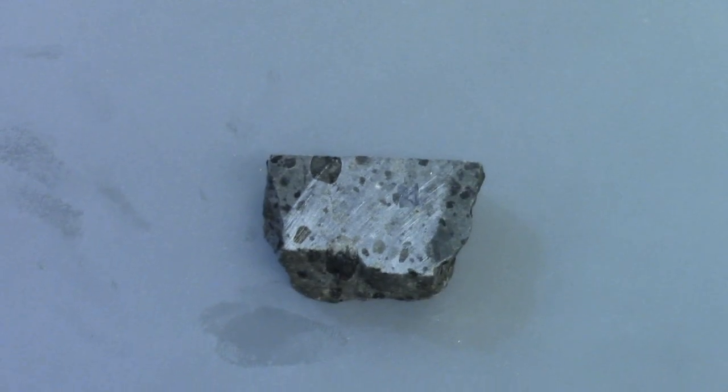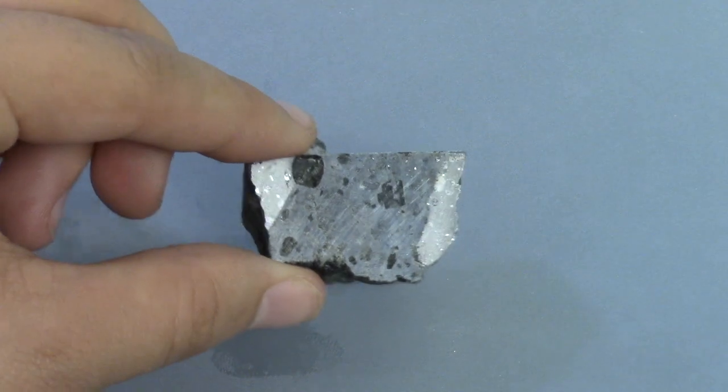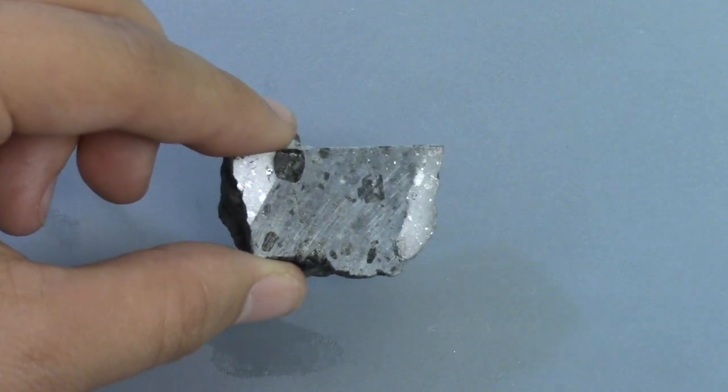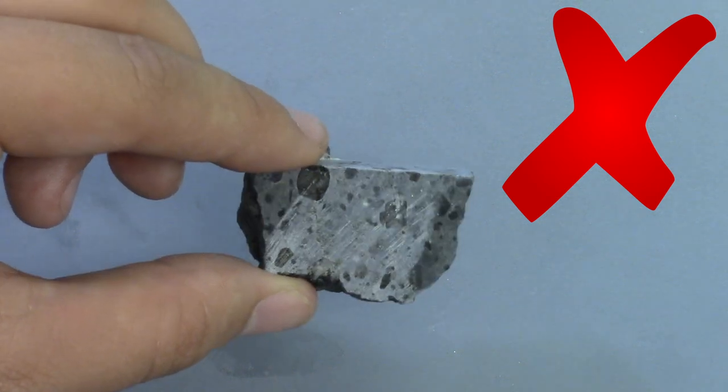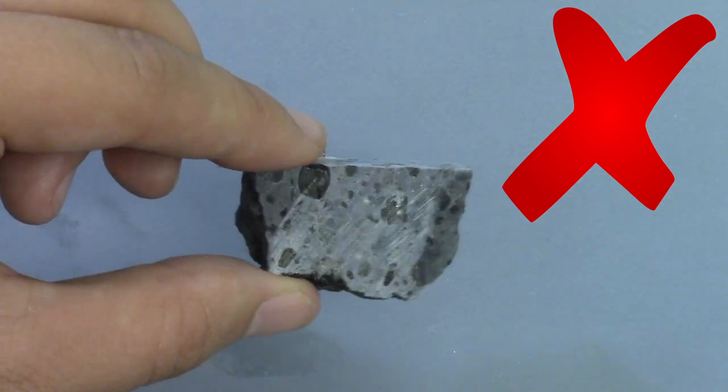For example, this one, the center is lower than the edges and so the center is dull and hasn't been polished correctly whereas the very edges on two sides are reflective only. So this one definitely needs some more work.